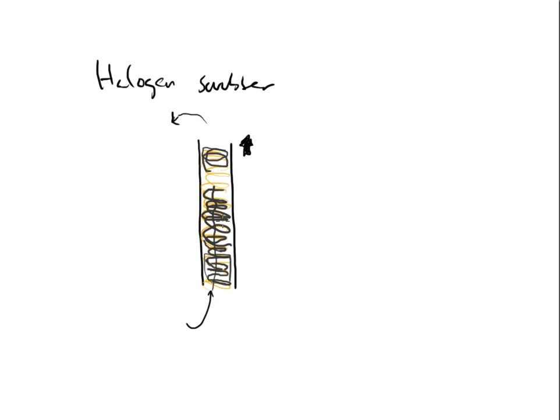Okay, I'm talking about a quarter of the way. If I start to see a quarter of the way that this copper is not as bright and coppery anymore, then that's a very good sign that I just need to go ahead and remove it and replace it with a new one, because that is a sign that halogen could be escaping my scrubber and making its way into the NDIR detector. And that's something that I don't want, okay?